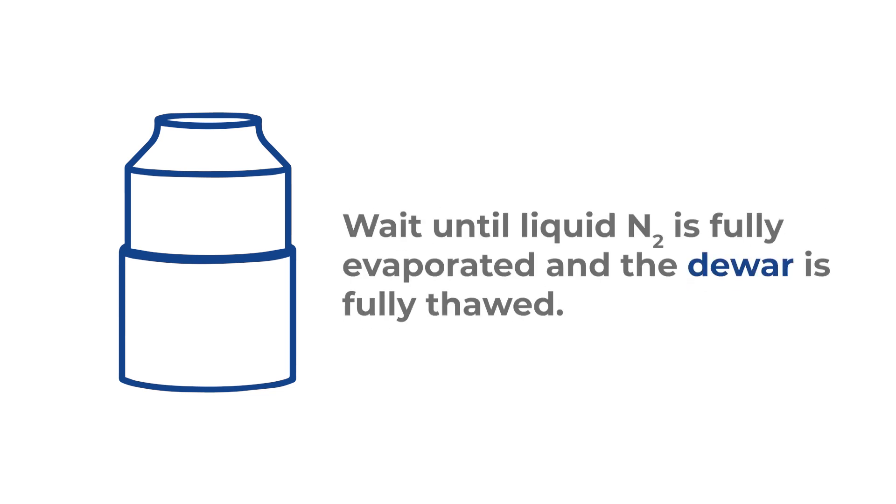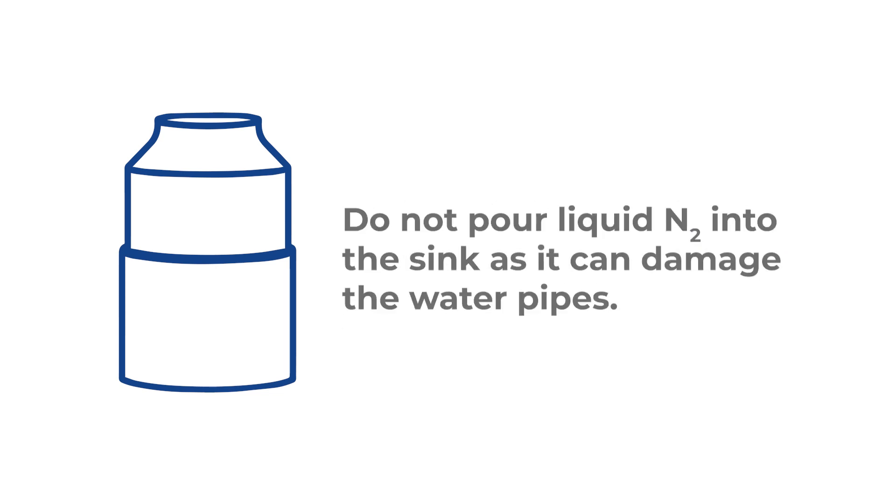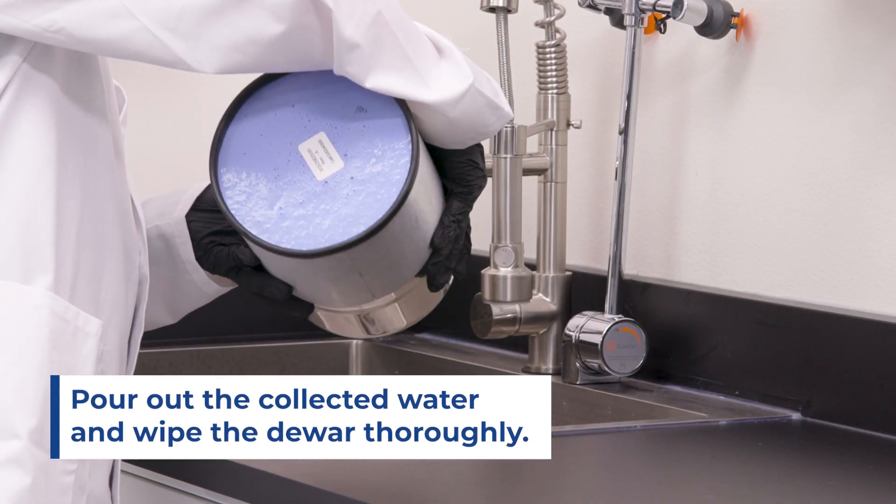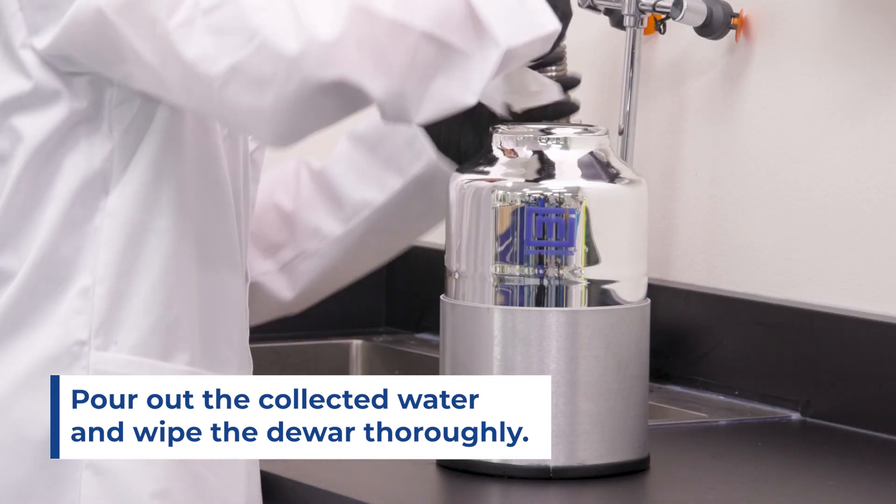To clean it, wait until the liquid nitrogen is fully evaporated and the dewar is fully thawed. Do not pour liquid nitrogen into the sink as it can damage the water pipes. Pour out the pool of water that has been collected over time and wipe the dewar thoroughly.